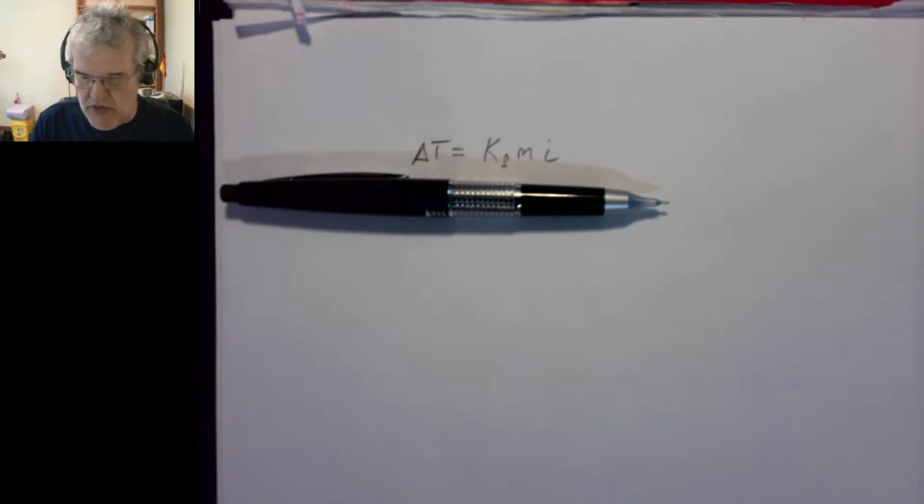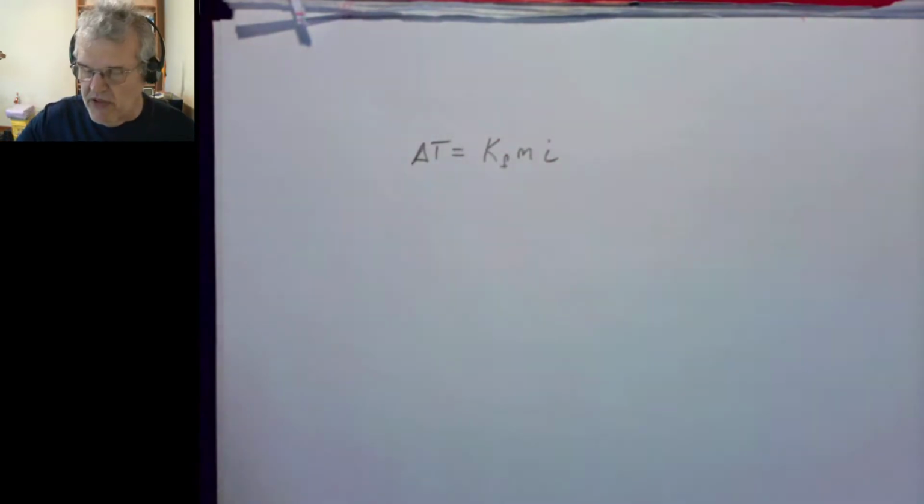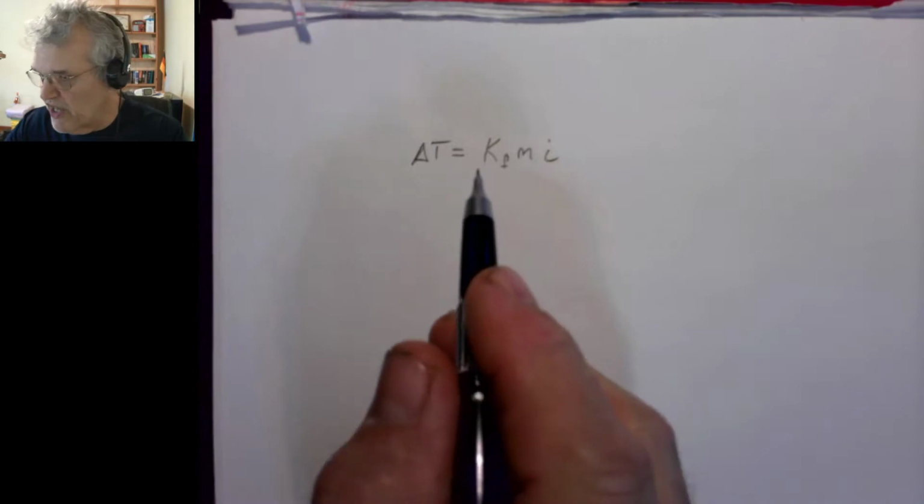So let's go through some of the calculations. Then we'll go through the lab. There are going to be changes. I'm going to change the way we're going to do the lab compared to the way they have it in the module. And that's just to make it easier for you and just makes more sense, makes less mess. The way they do it doesn't really make a lot of sense. And this is a lab that we do almost exactly the same lab when we do it on campus during our normal GChem 2 stuff. So let's go through this for colligative properties.